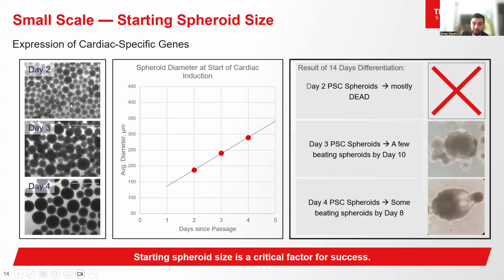at these things, even though the cells themselves within these cultures are phenotypically the same, right? They're pluripotent. We talked about this earlier. They express markers of pluripotency. They are typically karyotypically normal. You'll notice that the size of the spheroid confers that 3D biology is different here, right? That the center of these larger spheroids experiences different environments than potentially these smaller spheroids that are maybe a little bit more accessible in terms of nutrient or oxygen in the center.